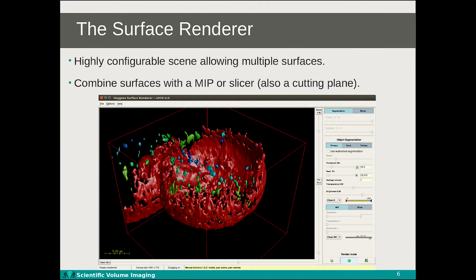Here we can see the actual surface renderer tool. The object can be rotated, zoomed and panned just as in the MIP renderer. Surfaces can be shown for multiple channels with different colors and thresholds. The isosurface for each channel generally segments your image into multiple discrete objects, which can be separated visually by using a custom color range. Aside from isosurfaces, a MIP can also be added as well as an orthogonal slicer. The slicer shows the image intensities exactly at the slice position while also functioning as a cutting plane, allowing you to peer inside your object and slice through it in a natural way.